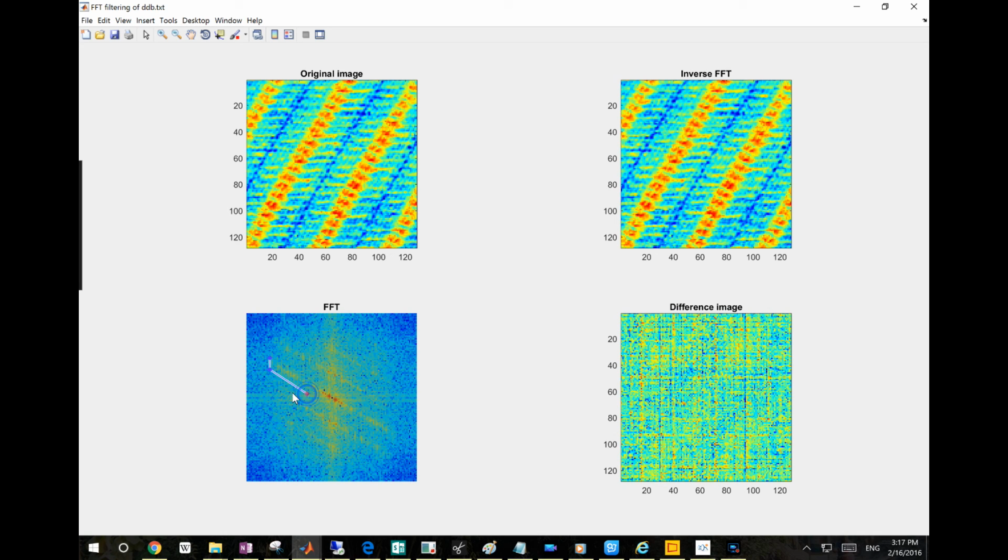Yeah, I only want to include the data that's periodical, that's useful, and other information is basically non-periodic information that likely is not typical to this structure. So if you only keep the periodic information, you get an averaged information of the structure of your sample.